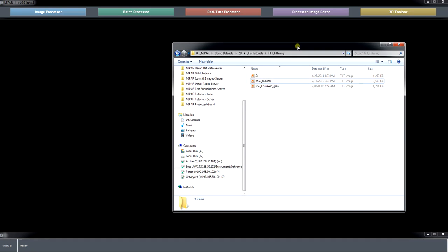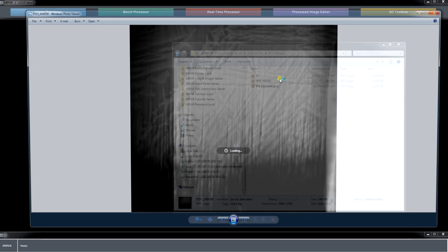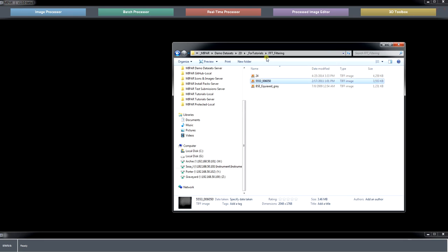So in this tutorial we are going to view three applications of FFT filtering. The first, which is perhaps the most common use, is to get rid of low frequency intensity variations in the image, so-called high-pass filtering. The second will be to remove curtains in a dual beam FIB serial section dataset, or to minimize them.